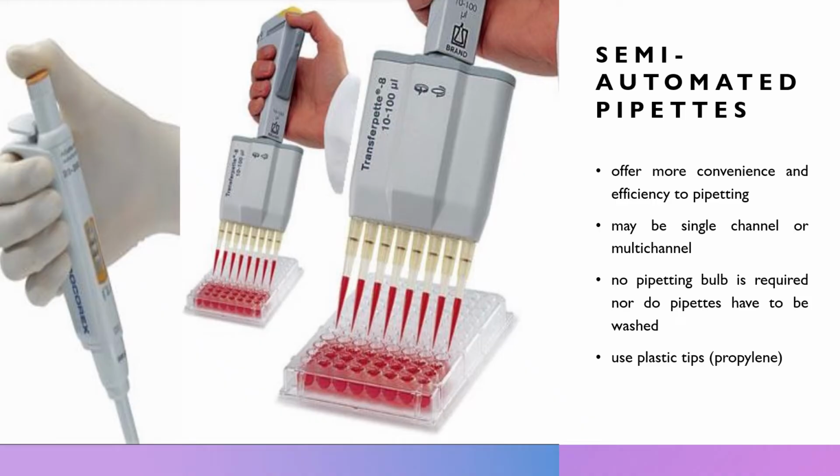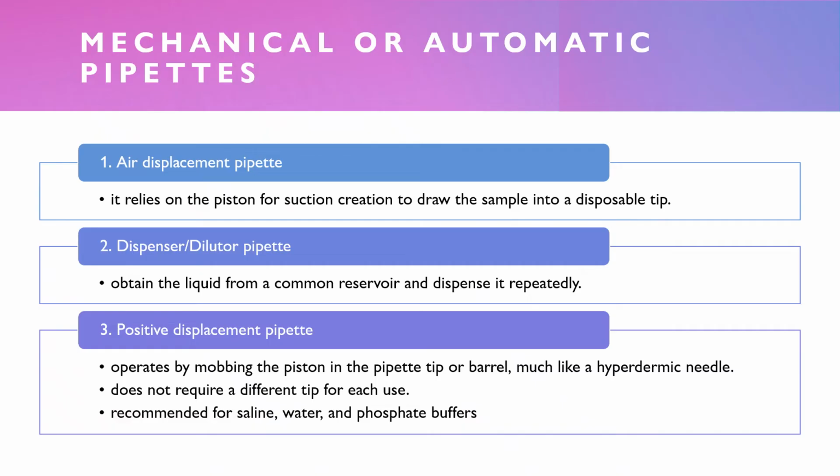Remember, a pipette with a pipetting capability of less than 1 ml is considered a micropipette, while the pipette that dispenses greater than 1 ml or 1000 microliters is called an automatic or semi-automated macropipette. In addition to classification by volume delivery amounts, automatic or semi-automated pipettes can also be categorized according to their mechanism. Either it's air displacement, positive displacement, or dispenser or diluter type of pipettes.